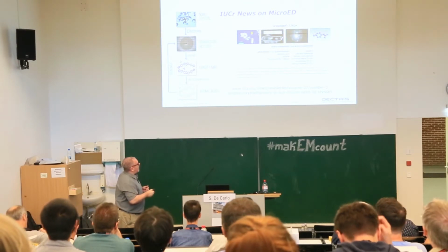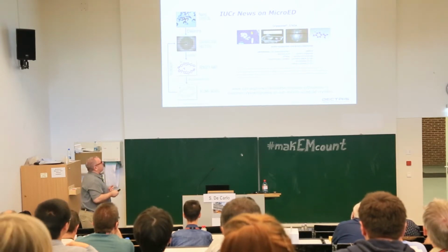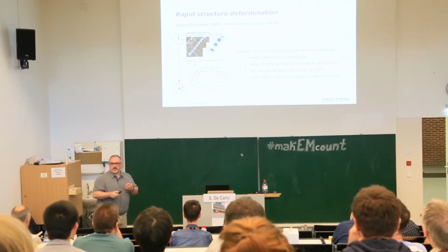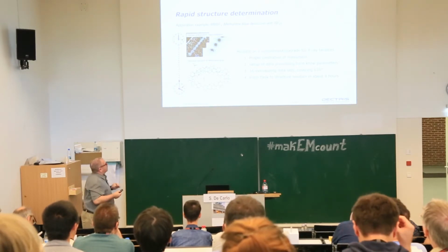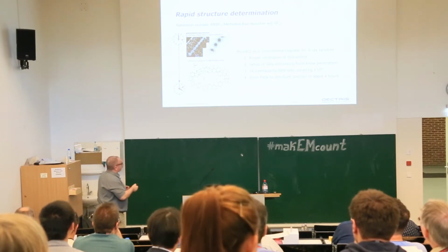If you look at the densities that you get with a single crystal, you might think that they're not good enough to be able to do atomic indexing, and I will show you other results which were obtained by Julian to counteract this impediment and come to data completeness which allows you to assign atomic density very precisely.